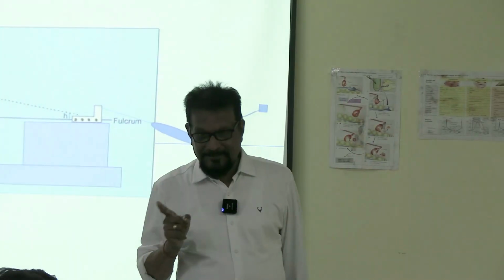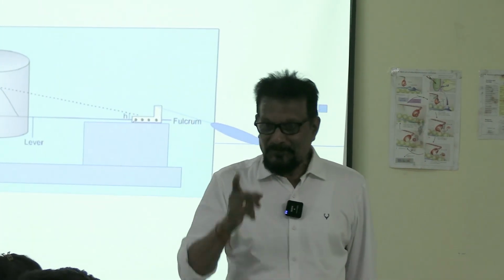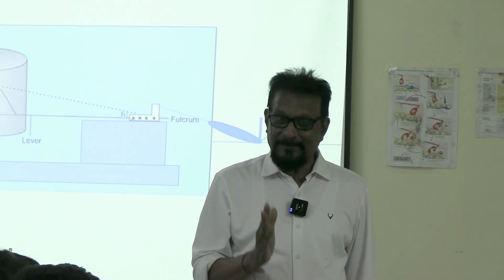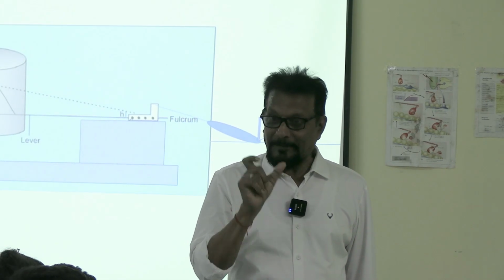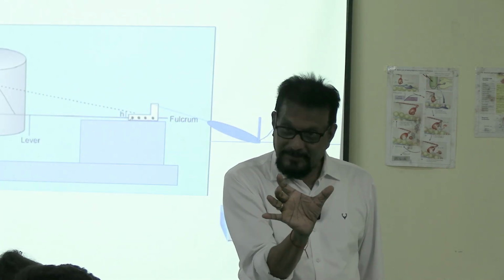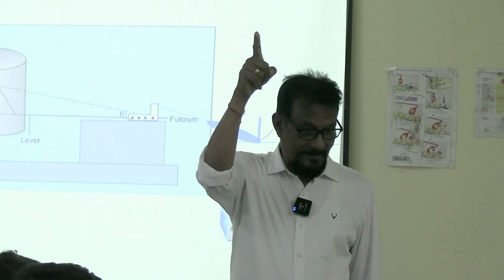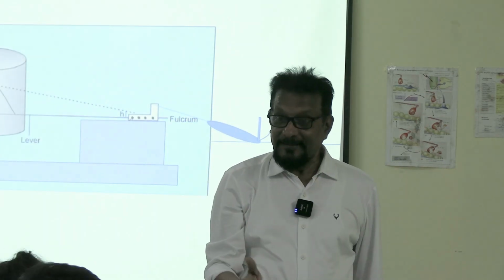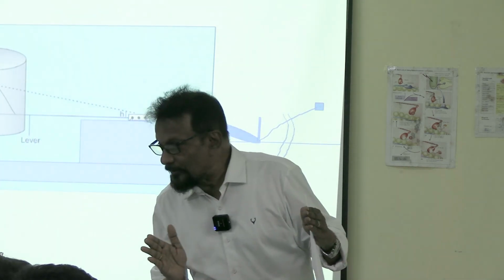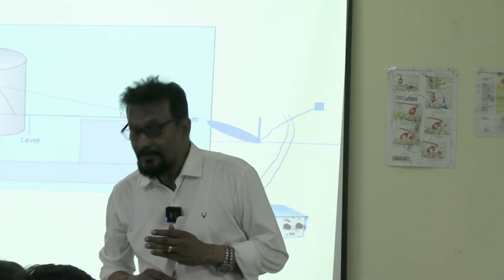So with this arc, you cannot find the vertical line. So you have to draw a vertical line if you want to calculate exactly the contraction period and the relaxation period. From the peak, you just draw a vertical line. That will be the actual. Then only you will be able to calculate the actual contraction. Any doubt?